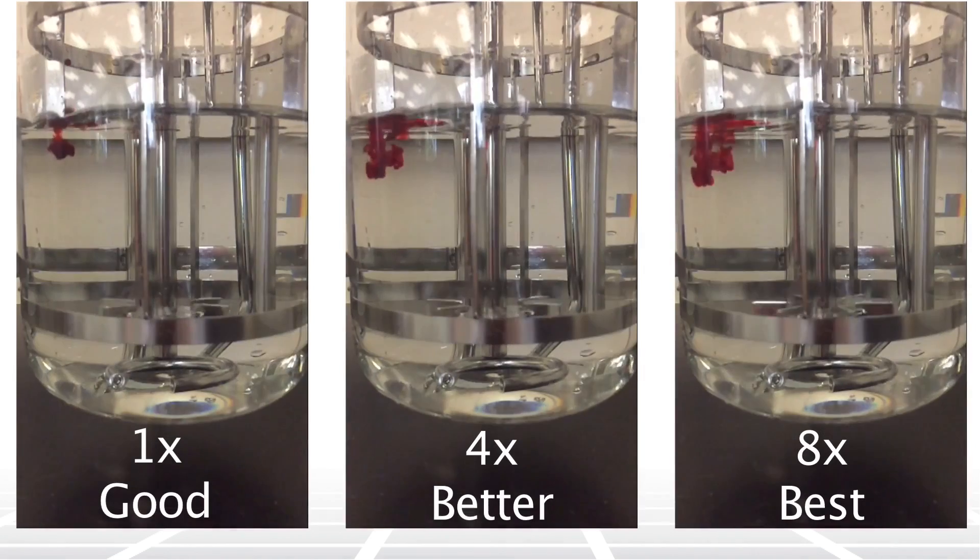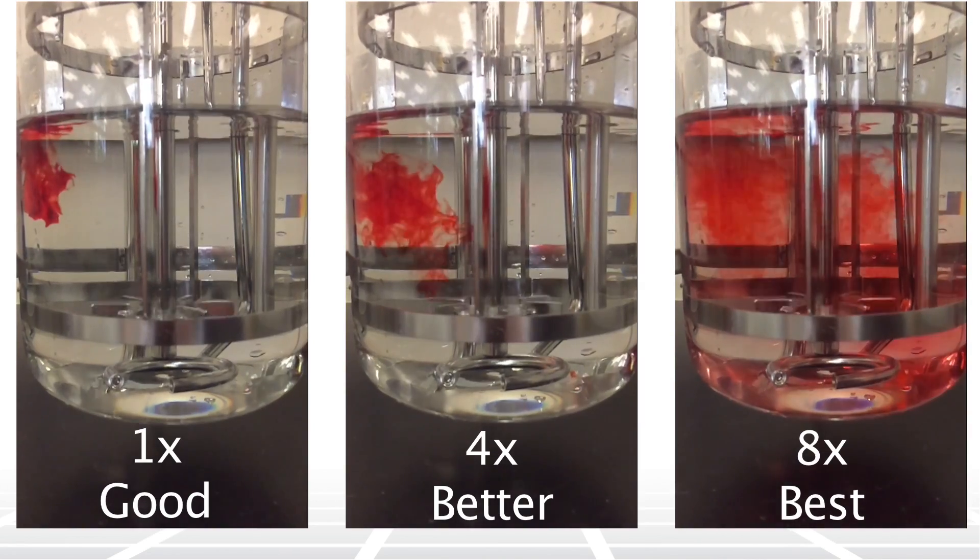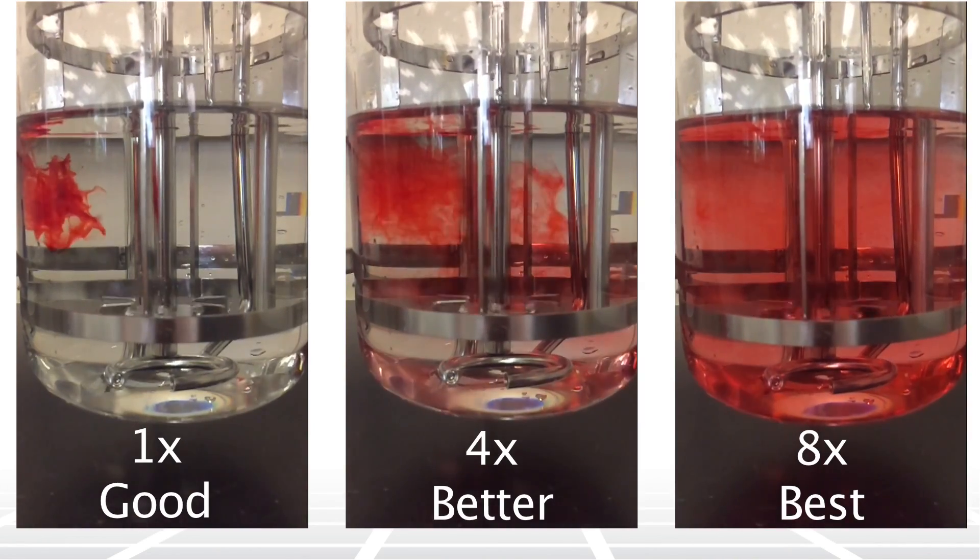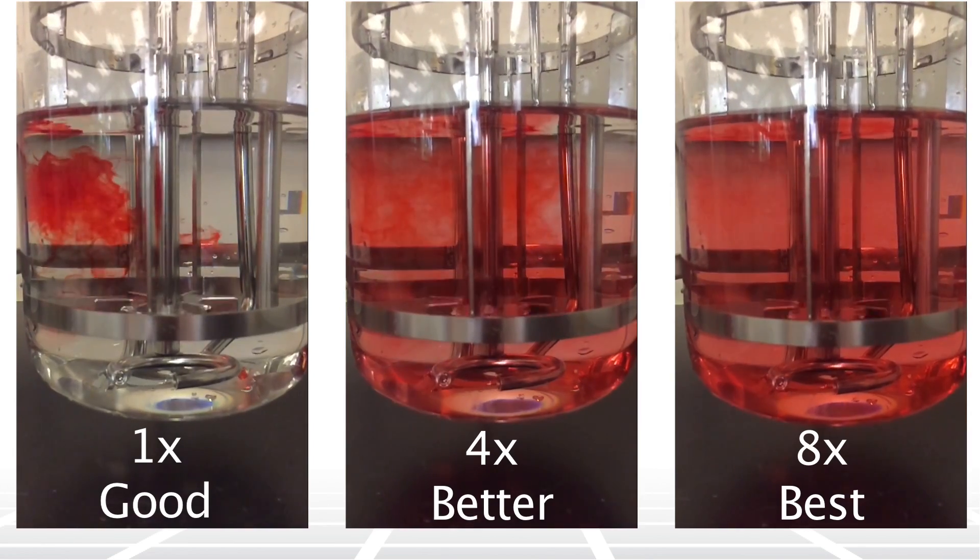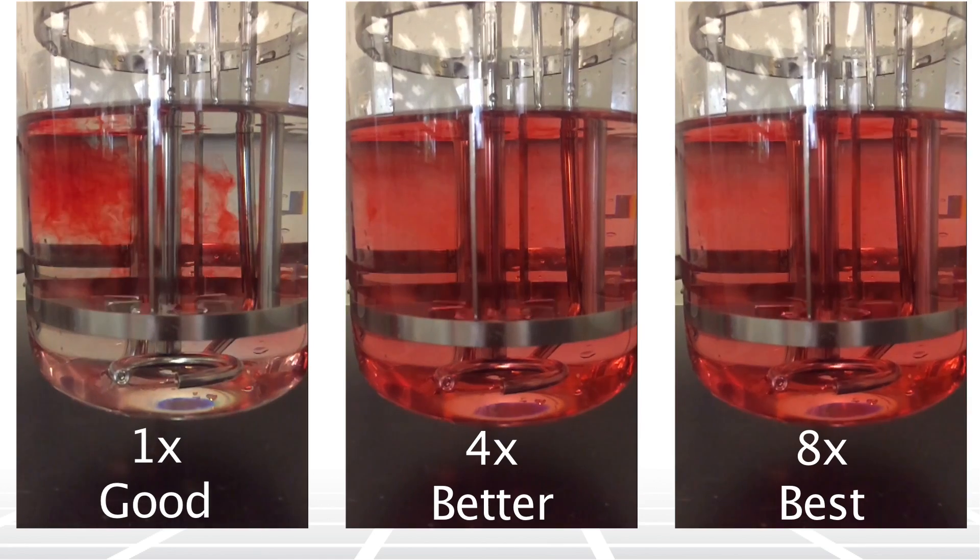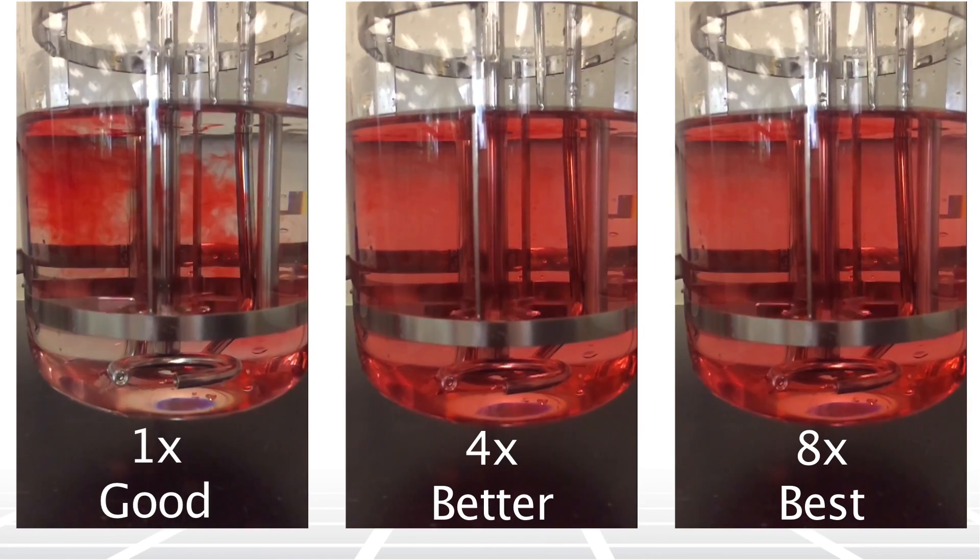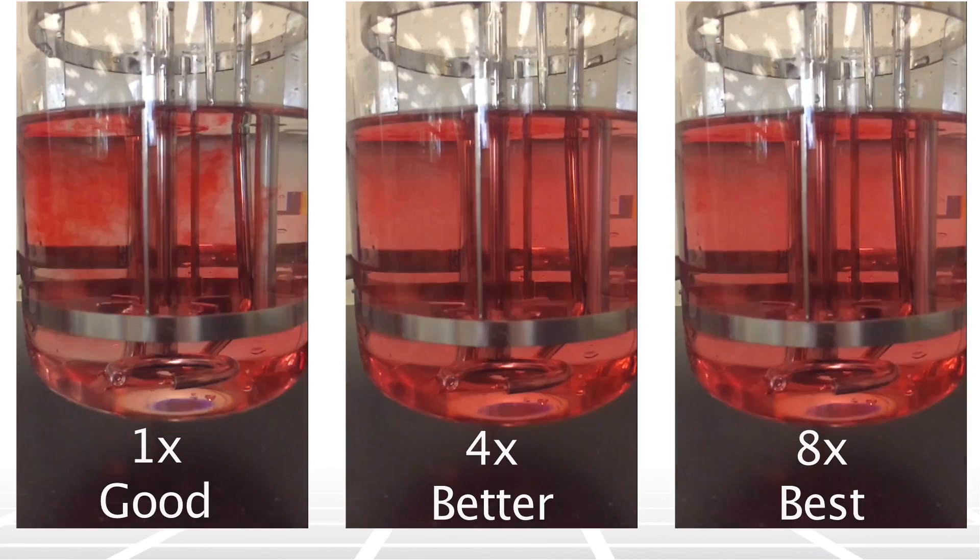Often during cell culture we must adjust pH through the addition of a base or an acid or provide more nutrients or media, and thus one of the primary purposes of mixing is to achieve rapid homogeneity of the contents of the bioreactor. The faster we can achieve homogeneity the better, particularly when pH gradients are involved.